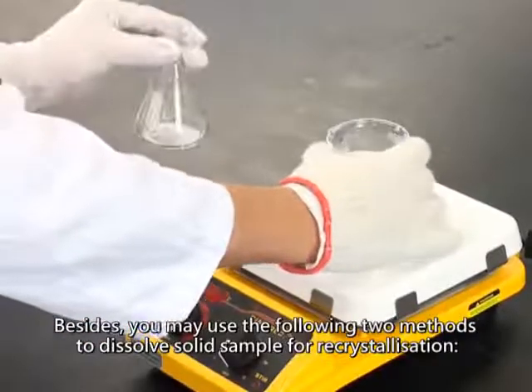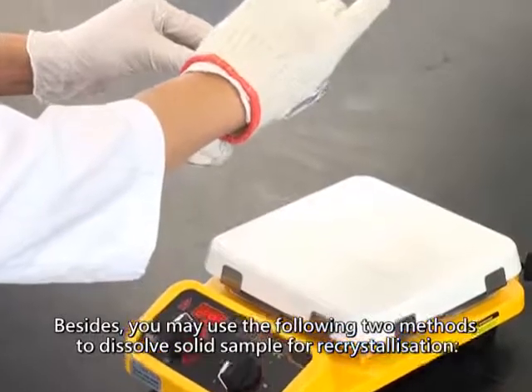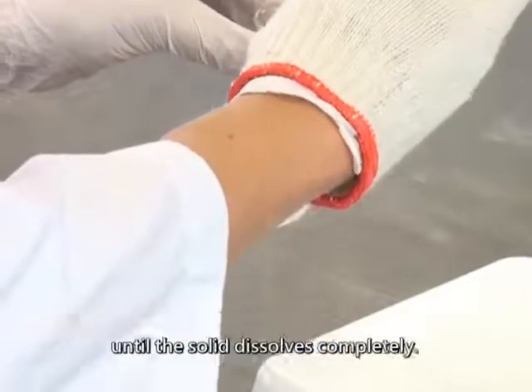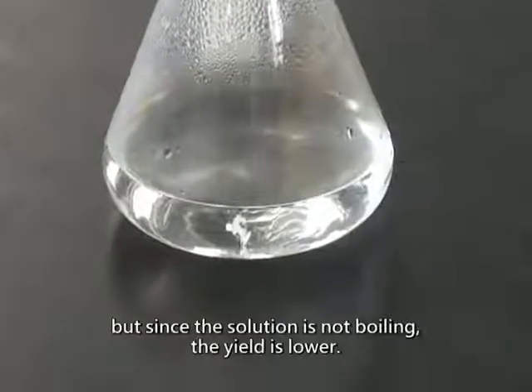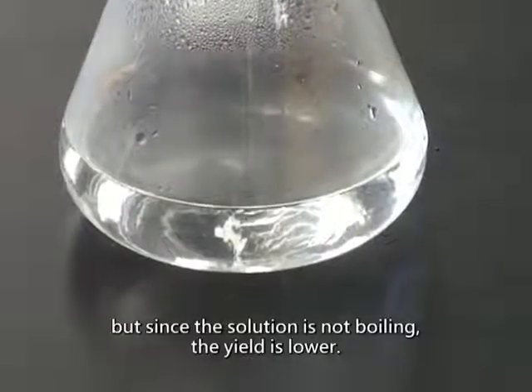Besides, you may use the following two methods to dissolve solid sample for recrystallization. Add a small amount of hot water in several portions to the sample in a conical flask until the solid dissolves completely. This method is simpler, but since the solution is not boiling, the yield is lower.